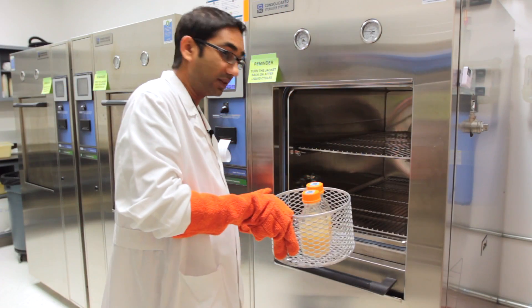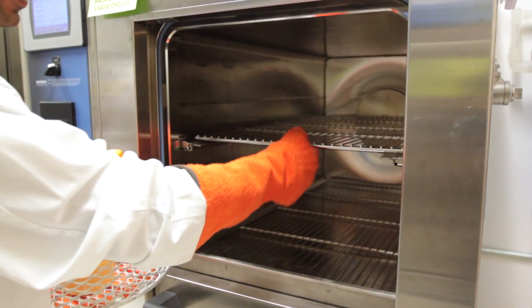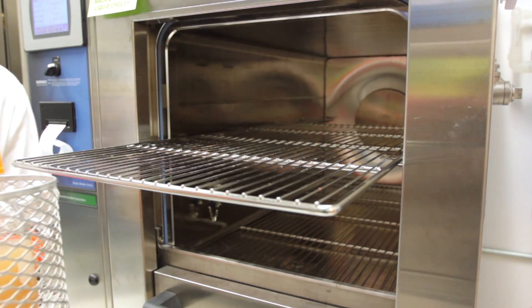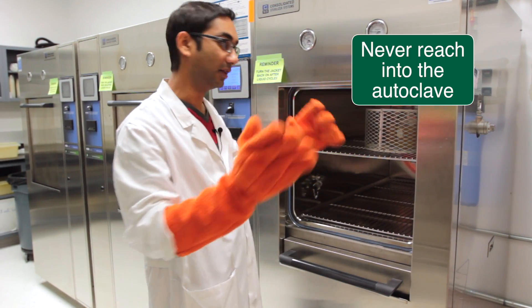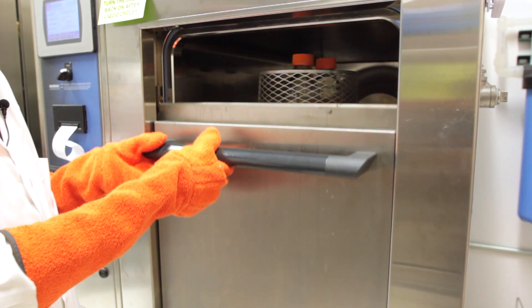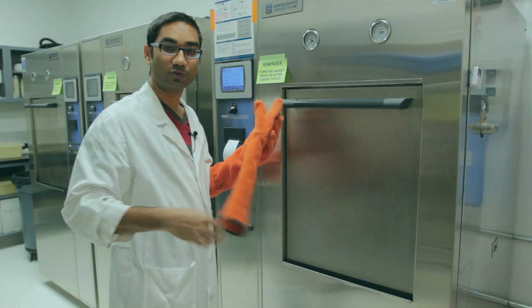Before loading, we do not want to reach inside the autoclave. If possible, pull the rack out so that we are not reaching inside — rather push it inside so we are not going all the way in. After the items are loaded, we can close the door using the lever and then select the cycle of our choice.